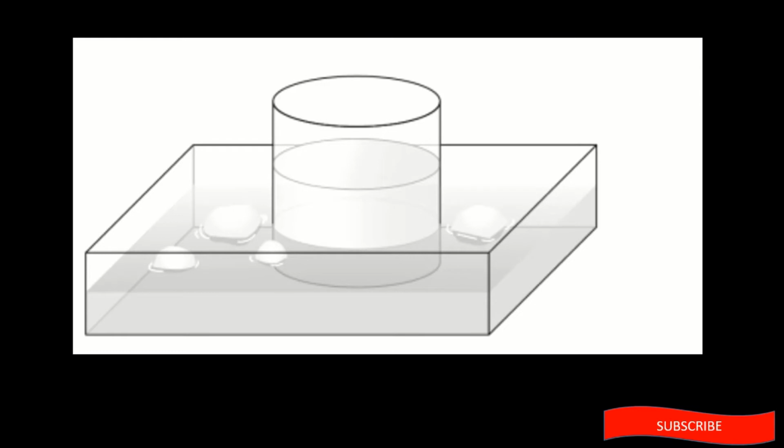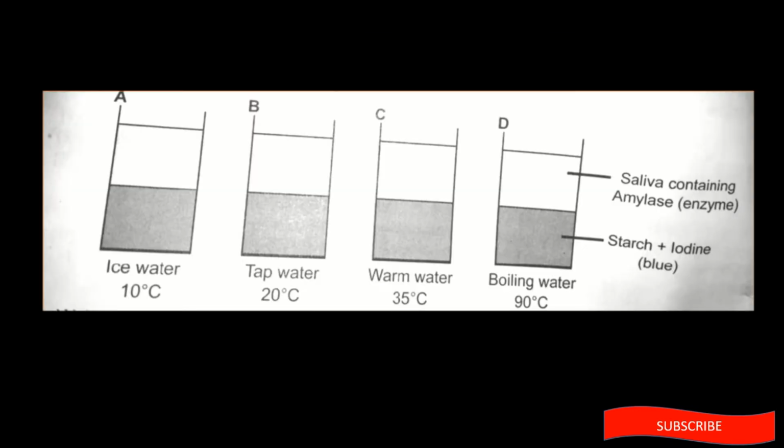All right, so let's look at the results. What should we expect at the end of the day? What will happen? Because test tube A is in ice water, this is low temperature. Because this is low temperature, we know that our enzymes will be inactive.